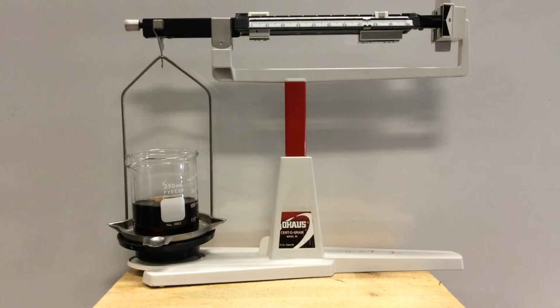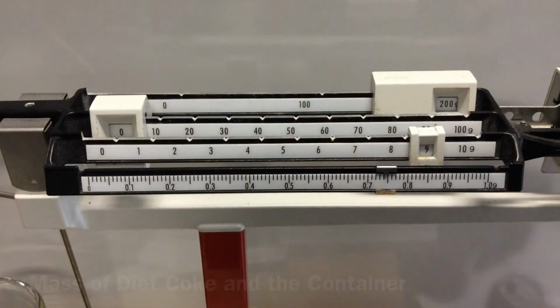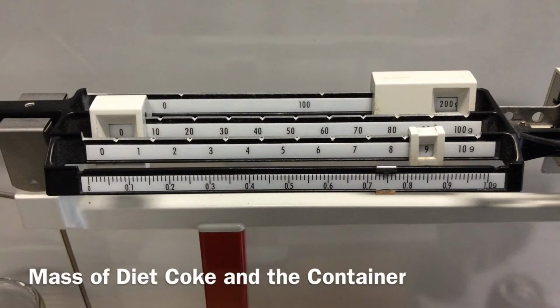Now my Diet Coke, last liquid, I've moved my riders and I have balanced it off, and let's get up close and personal and read that value. And there is our value for our Diet Coke. Write that down, make sure you have the right level of precision for this device. I've been using it the entire lab, so it should be similar in its precision, and make sure there's a unit associated correctly with this device.